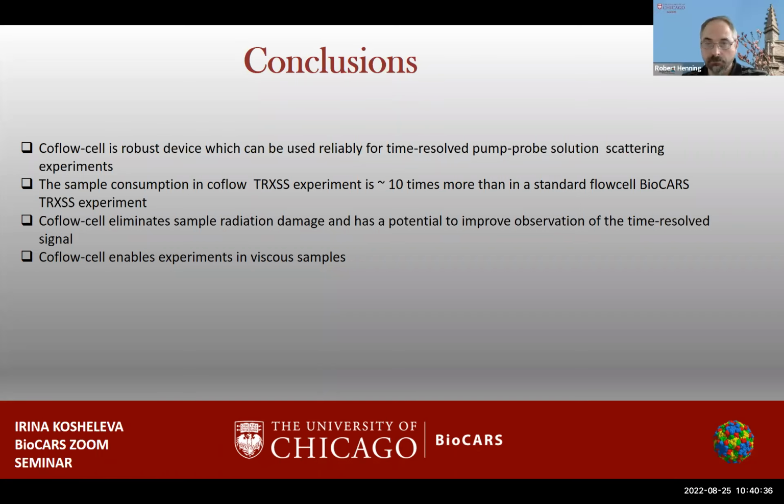Okay, great. Any questions? Hi, this is Friedrich. Yeah, very nice presentation, Irina. Thank you very much. You made some remark about whether it's possible to recover the sample. If I understand right, the outer flow is just water, isn't it? So it mixes with the PYP solution. Is that correct?